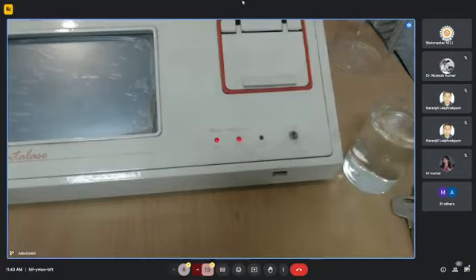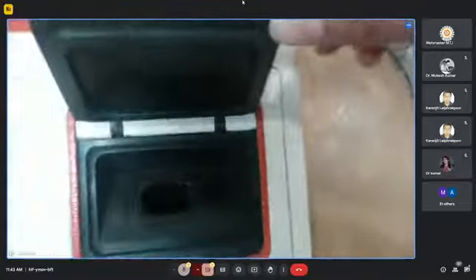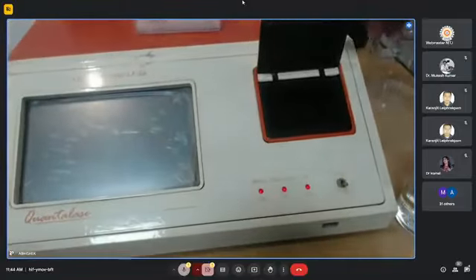If there is any leak or crack in the cuvette, or by human error some water gets spilled in the cuvette chamber, then some of the uranium will get absorbed by the anodized layer of the inner wall of the chamber.